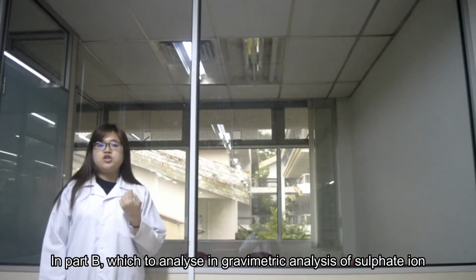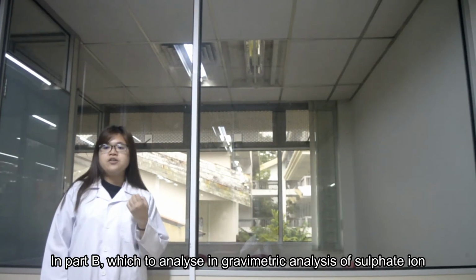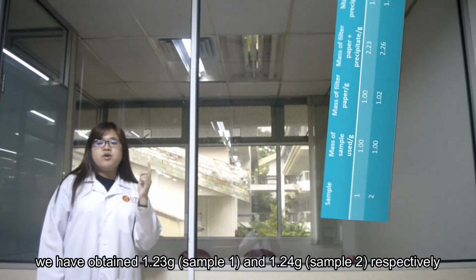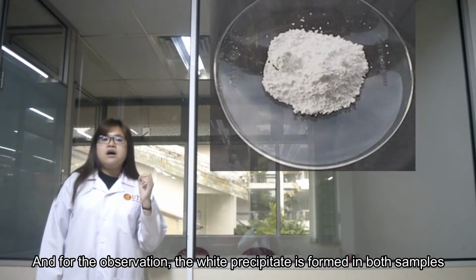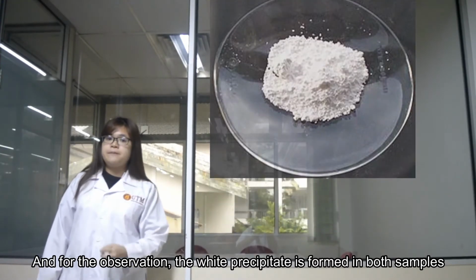In part B, we wish to do gravimetric analysis of sulfate ion. We have done 2 experiments, and from the result, we obtained 1.23 grams for sample 1 and 1.24 grams for sample 2 respectively. And from the observation, the white precipitate is formed in both samples.